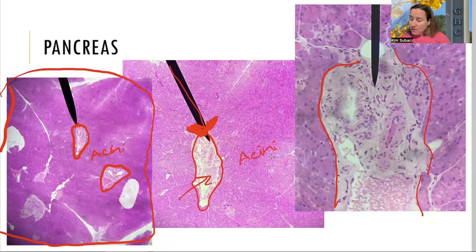And if we zoom in on the islet of Langerhans, you can see all the different cells in here. And these different cells are going to produce, again, 4 things: insulin, glucagon, somatostatin, and pancreatic polypeptide, or PP, coming from the islet of Langerhans.